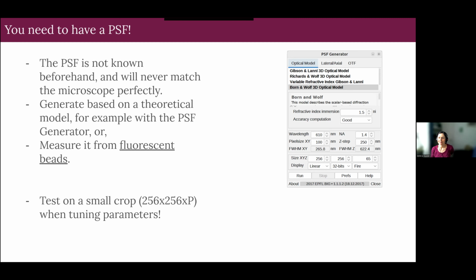So, has everybody managed to do a couple of tests in this? So you're going to have this assignment where you have to try the PSF plugin yourself with your own images. And then you will need to tell us what happened.